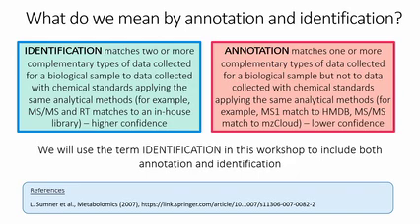Most of what we're doing is actually annotation, and there are different levels of confidence within annotation as well. Annotation is typically where you're using maybe two, maybe one type of data within the LCMS. It might be retention time, MS1 data, or MSMS data, and you're matching it to databases or to mass spectral libraries or retention time libraries, but they haven't been created in your laboratory.